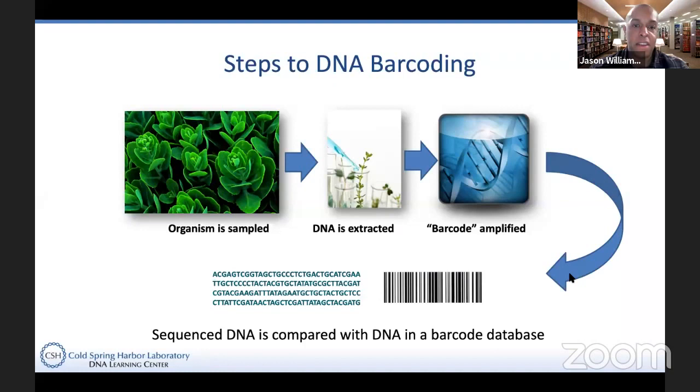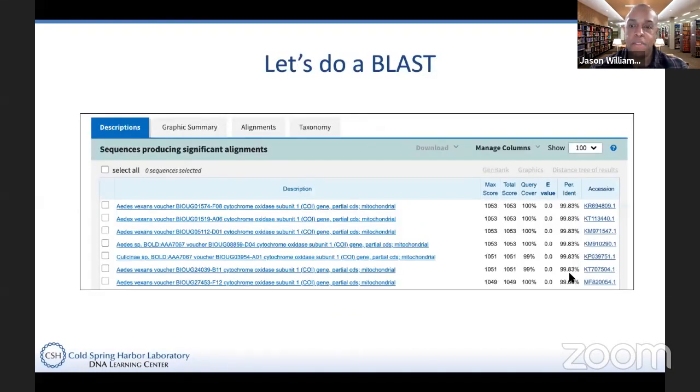And the technology of the technique is this DNA barcoding. We are doing a bioinformatics laboratory here, so we're not covering the first few steps in a lot of detail, but once you sample your organism and extract your DNA, you can amplify the barcode via PCR and also do the bioinformatics bit. And we have another series on DNALC Live that is going into all of those steps in detail. So check the website, and if you want to learn more about that, please go ahead and take a look at those.